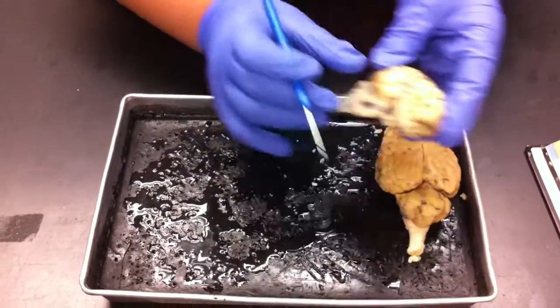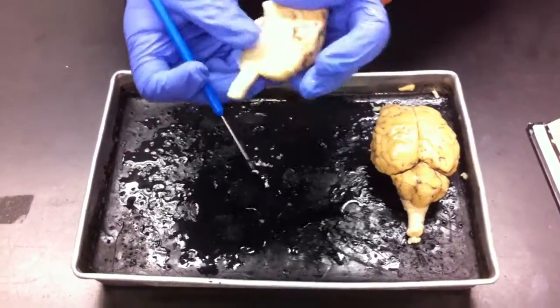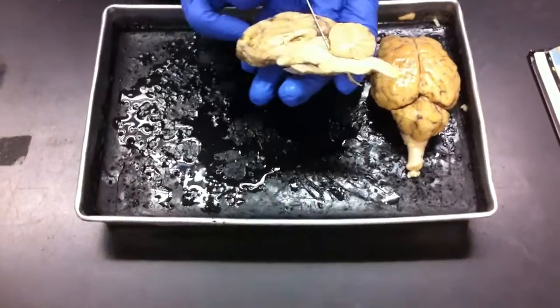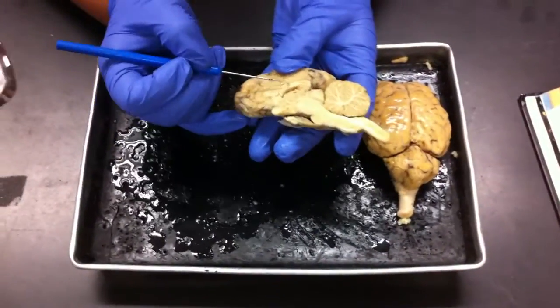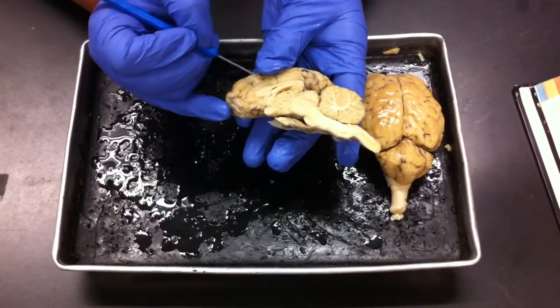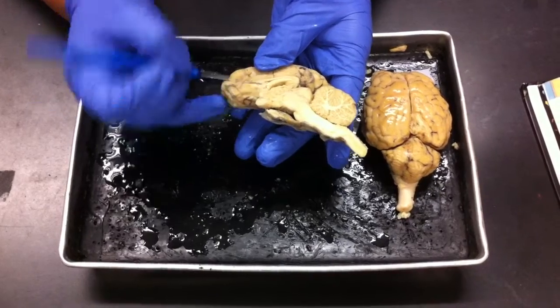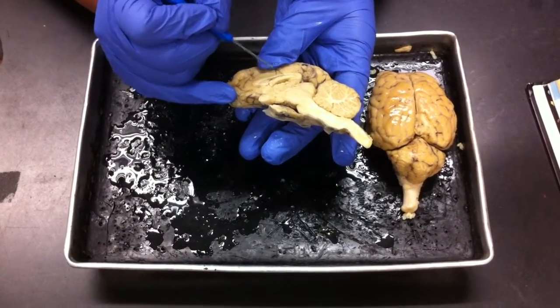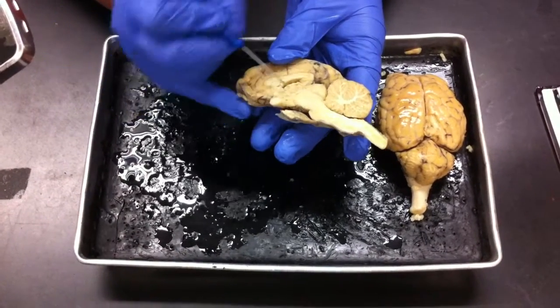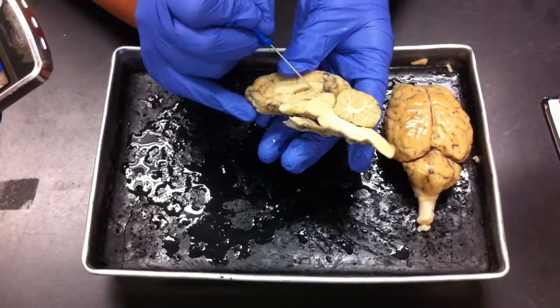Now we're going to look on the inside. This portion right here is an example of the dura mater. It's hanging off right here. This area right here is where the falx cerebri would fall in. Just like in our brain models, guys, this C shape is the corpus callosum. This small sheath right here that's kind of torn is the septum pellucidum. At the base of the septum pellucidum is the fornix, followed lower down by the choroid plexus. This area right here encircled is the thalamus, and then the region below would be the third ventricle.